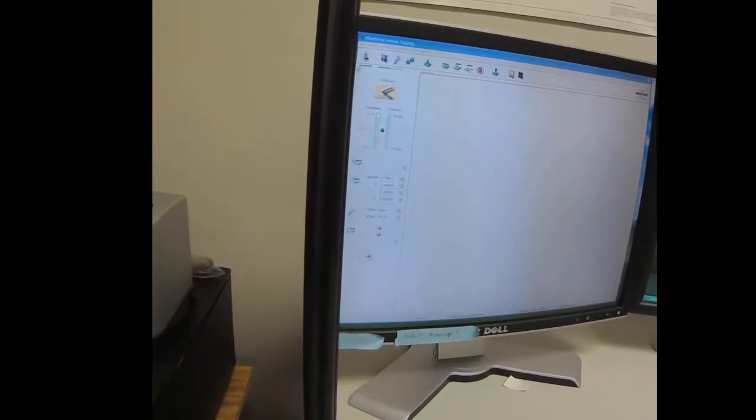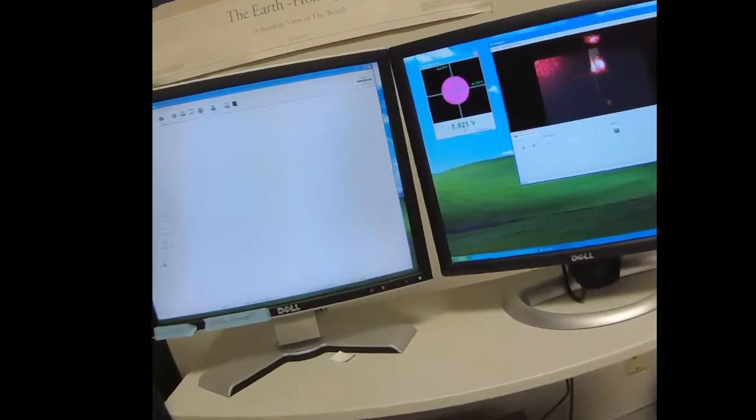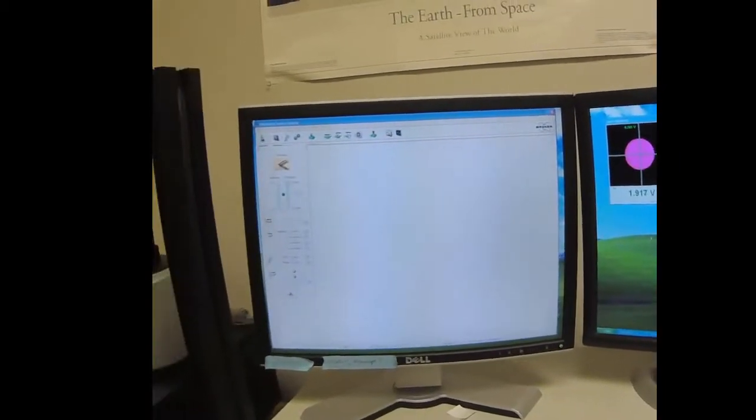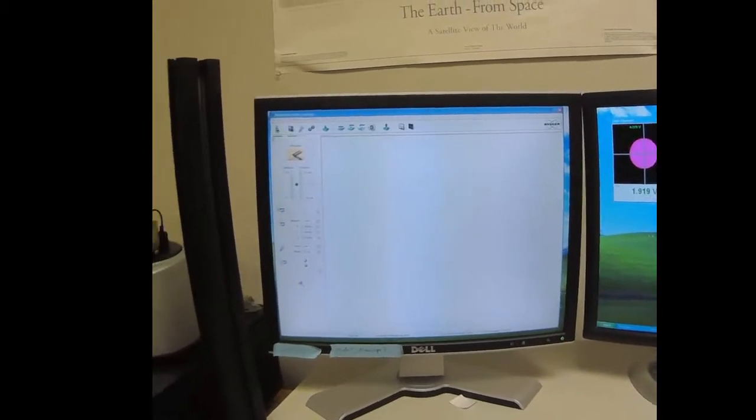So that's centered. And two volts is a good amount of signal. So we've completed the laser alignment. Now we are ready to collect data.